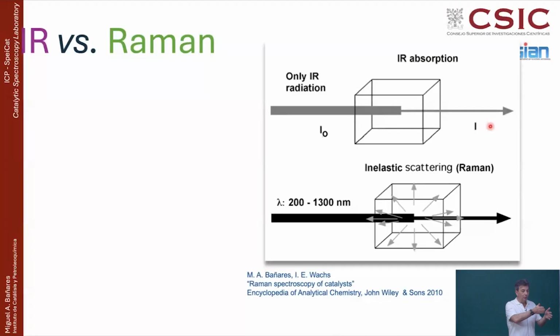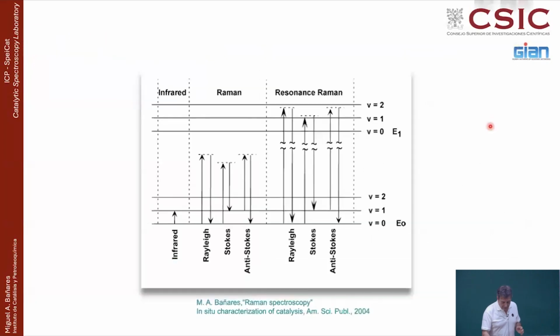green, yellow, blue, violet, will do it. And if you go to ultraviolet, it will do it. And if you go to X-ray, you will do it. And actually, you can go to a synchrotron and make Raman scattering of X-rays, which very few people do, but you can do it. So the nice thing is that you can do that.